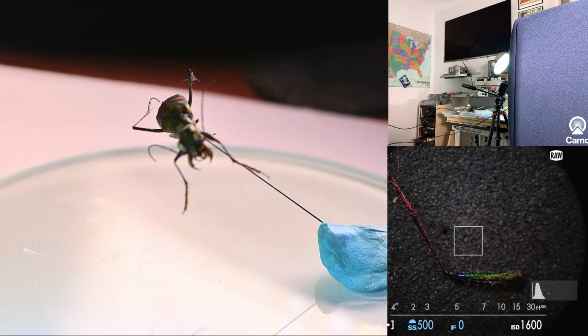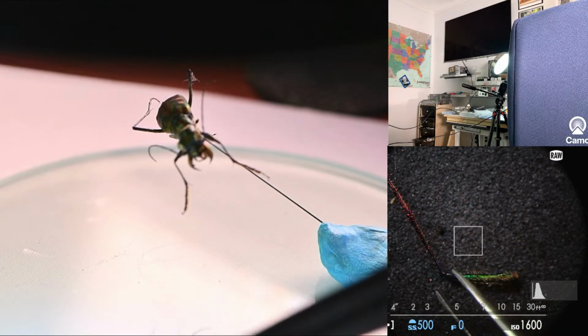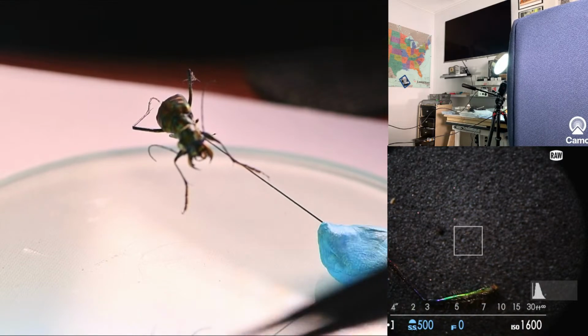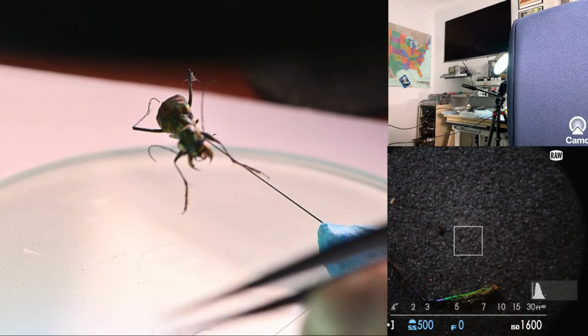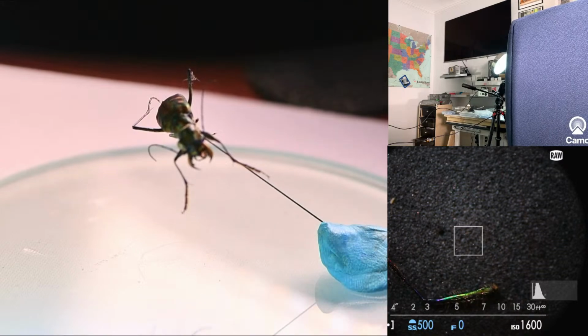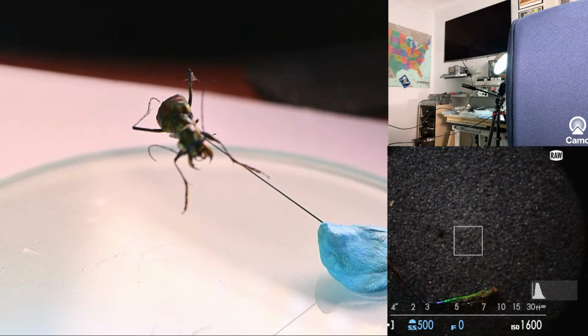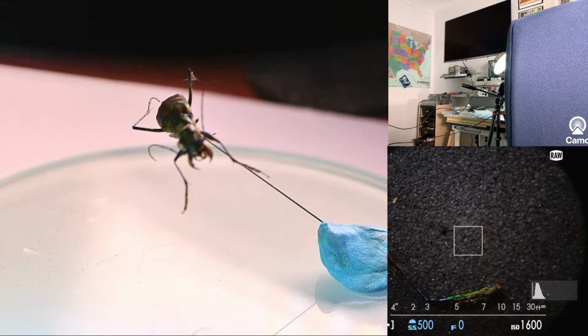Now what I do, and this is what's really important, one of the take-home messages here, when you're sharpening your tweezers to manipulate an appendage, it is crucial that the tips of the tweezers come together, but the bit right behind the tip does not. In other words, they need to be pinching together at the tip, not halfway up the grabby bit. That's important because otherwise you don't have accurate control. And the way you do that is using one of these.